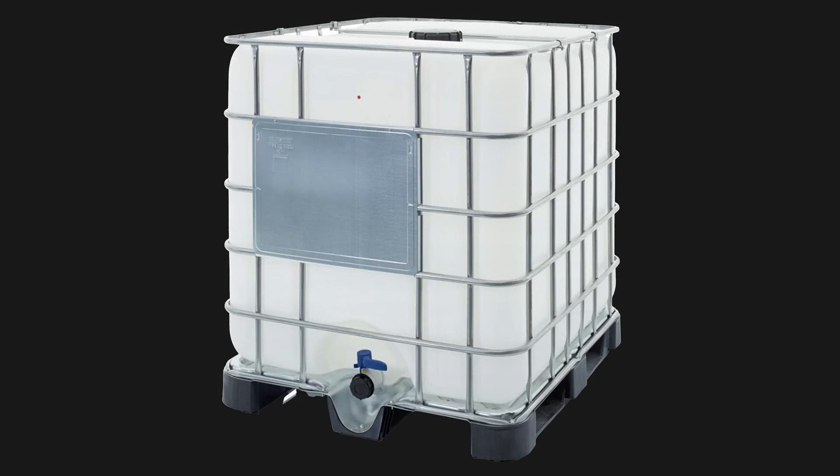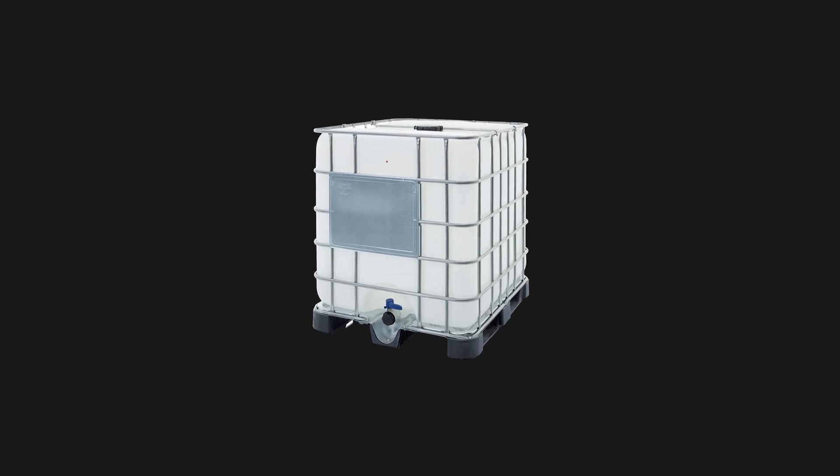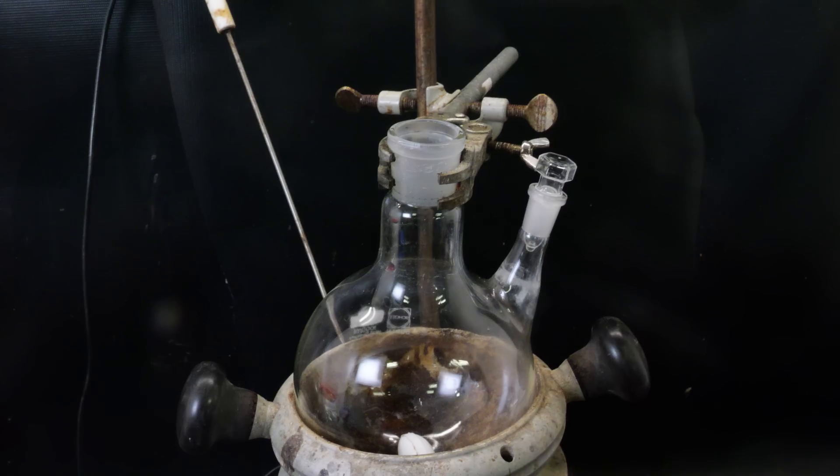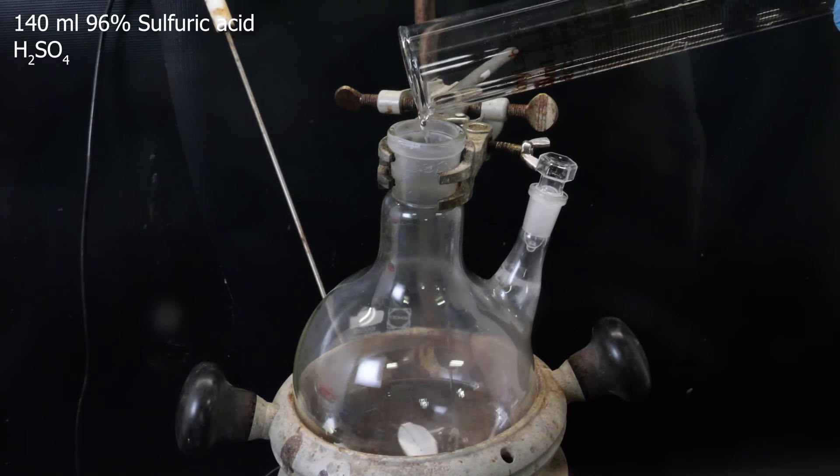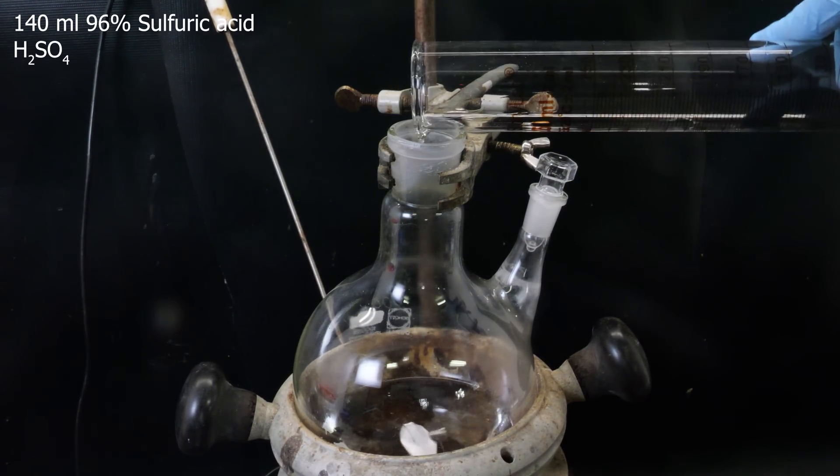I don't need a huge amount, so I'm going to see if I can get away with being a little bit lazy. So I set up a flask in a heating mantle and add in 140 ml of 96% sulfuric acid.